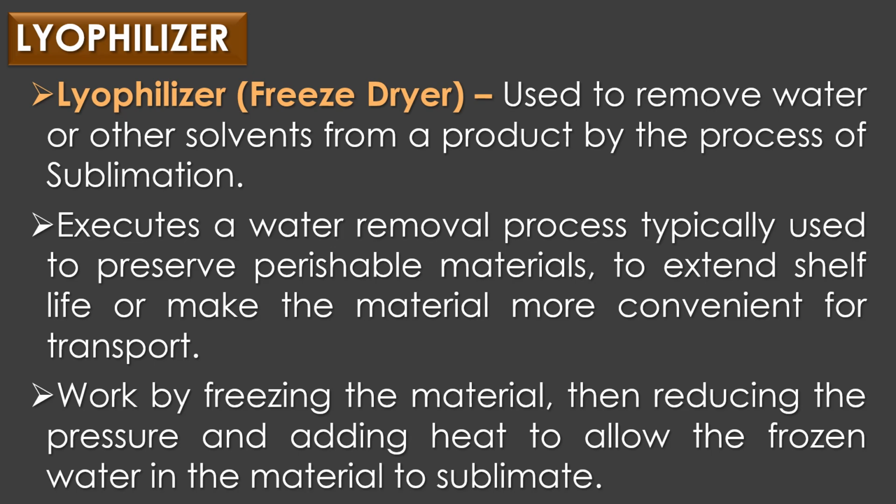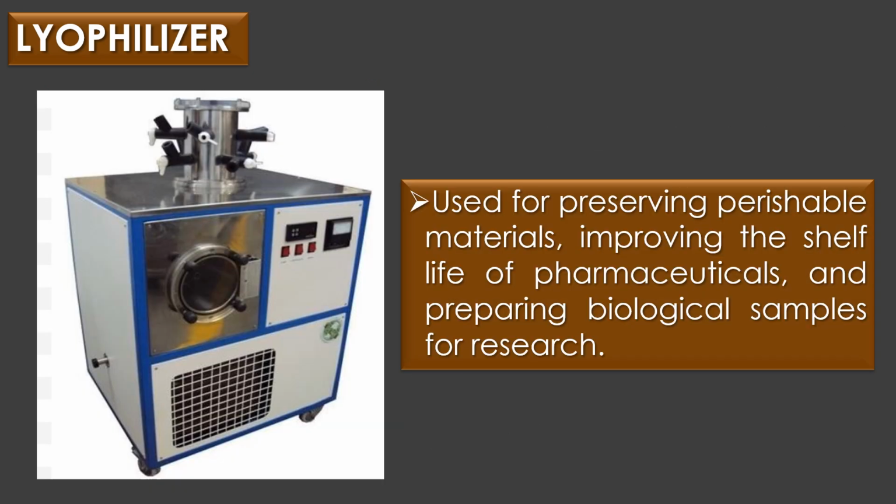Lyophilizers work by freezing the material, then reducing the pressure and adding heat to allow the frozen water in the material to sublimate. Lyophilization technique is widely used for preserving perishable material, improving the shelf life of pharmaceuticals, and preparing biological samples for research.